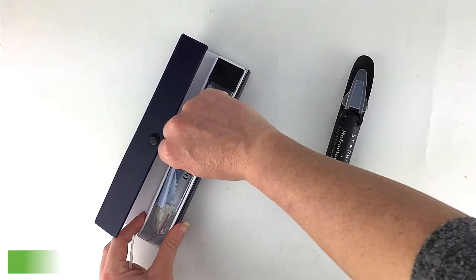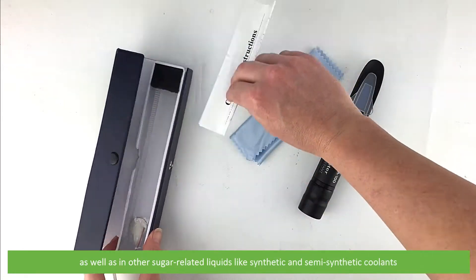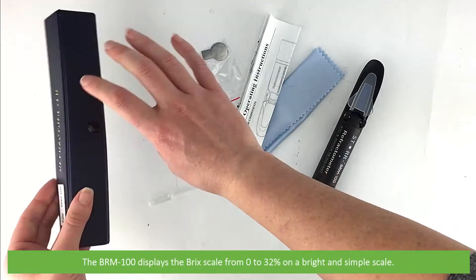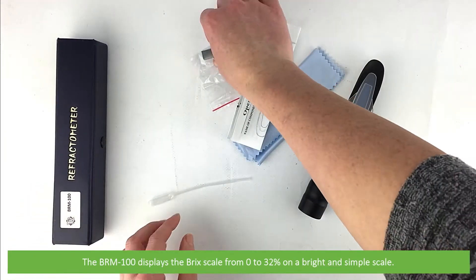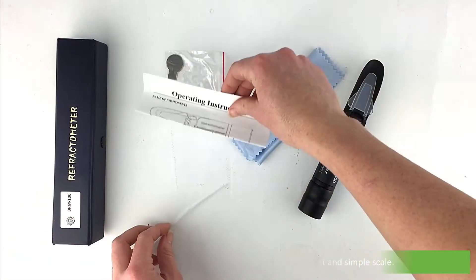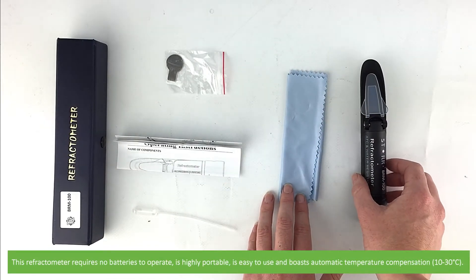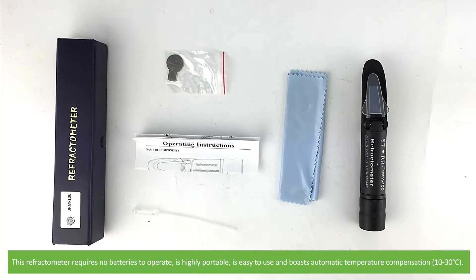wine and soft drinks, as well as in other sugar related liquids like synthetic and semi-synthetic coolants. The BRM100 displays a Bricks scale from 0 to 32% on a bright and simple scale. This refractometer requires no batteries to operate, is highly portable, is easy to use and boasts automatic temperature compensation.